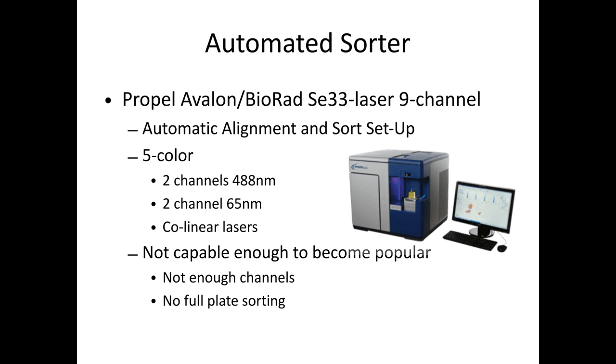It was pretty cool. And my original thought was this would be really popular on the user base for self-service. But it turned out it was just not capable enough to become popular in my lab. There wasn't enough channels. There's only 2 lasers.